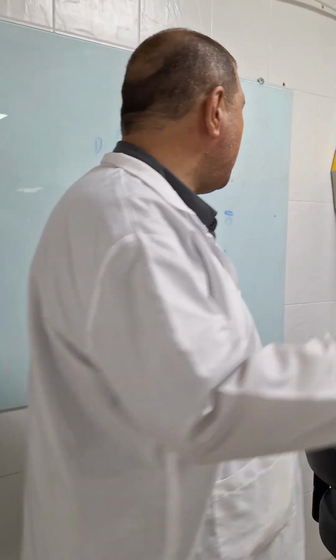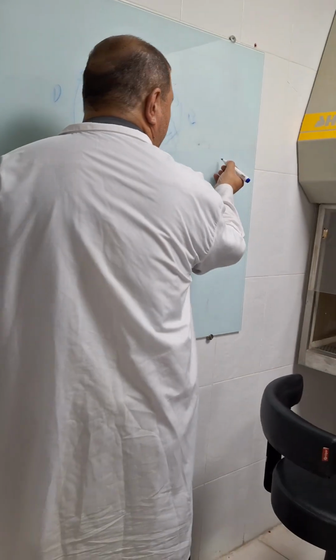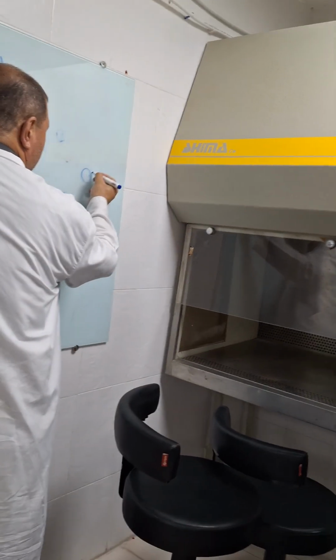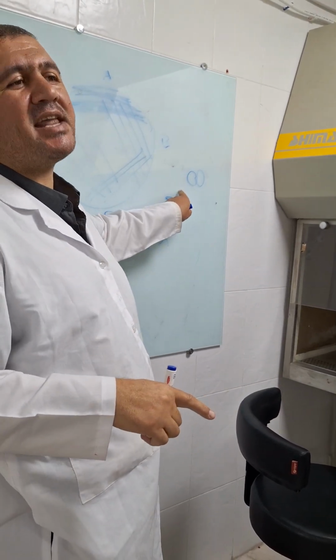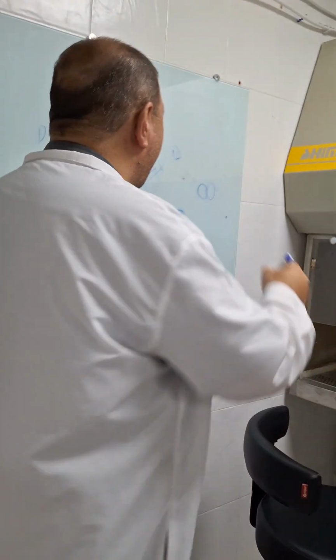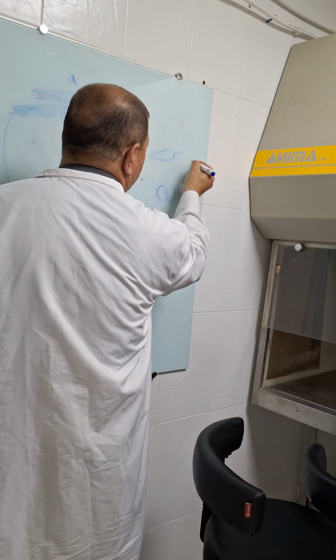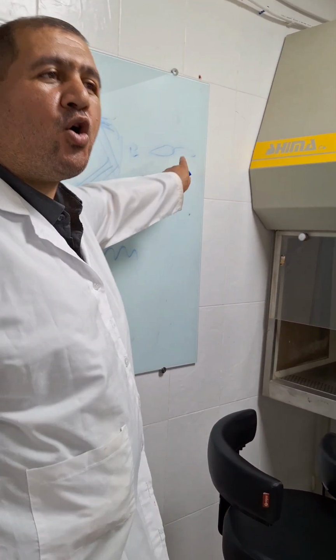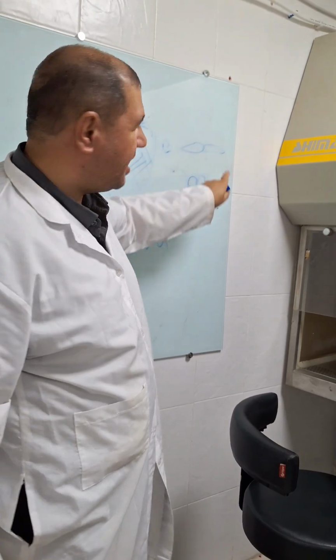Okay? And different arrangements of bacteria. For example, diplococcus. This is Neisseria, gram-negative diplococcus. And pneumococci, this pattern. Gram-positive diplococci. Gram-negative. Tell me an example of gram-negative diplococci.